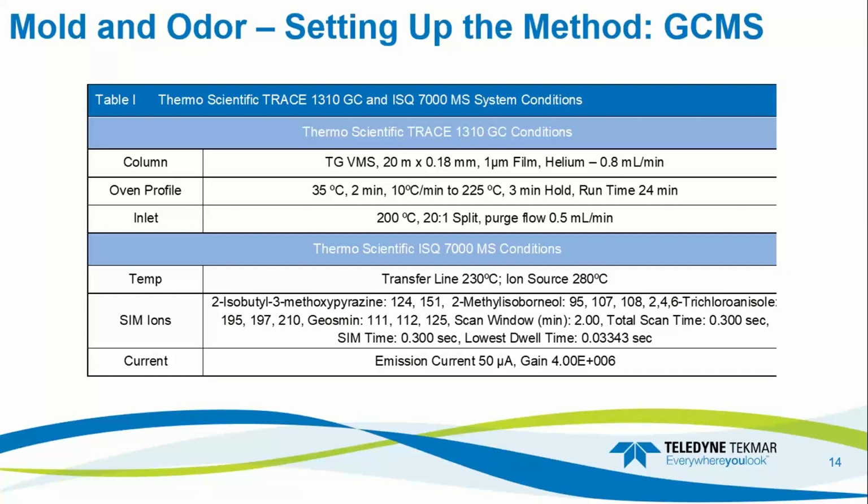The less water going onto the GC column means less water that's getting to the mass spec as well, and this can extend filament life and allows for less source cleaning, which is a huge time saver because that's a long process.